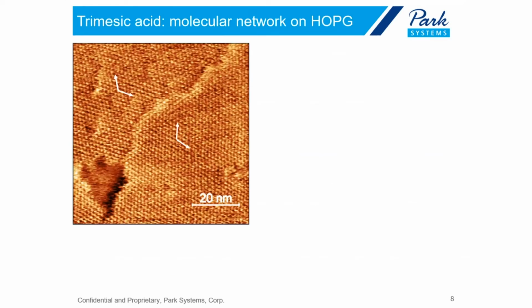So when we put those molecules on a piece of graphite from water, we can observe a very nice hexagonal network here. And the interesting thing about the image, it shows you the precise control of forces in the atomic force microscope, because we can observe nicely the edges of the molecular layer and how those delicate structures are preserved during scanning without being destroyed.